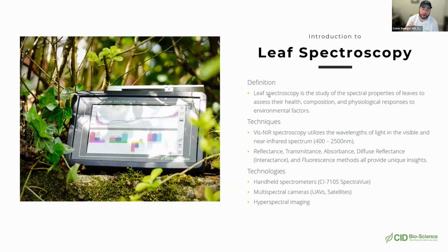That would require you to create the calibration first and then go out and use the device in that way.